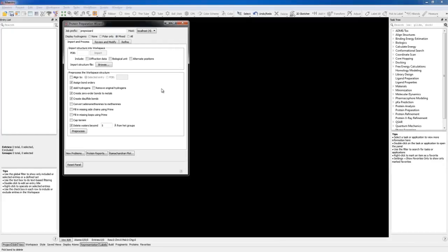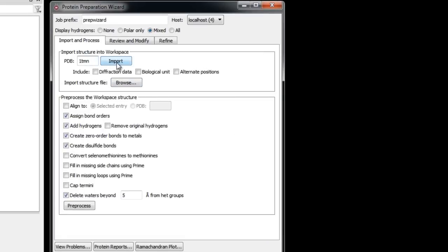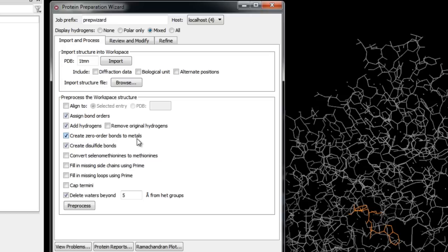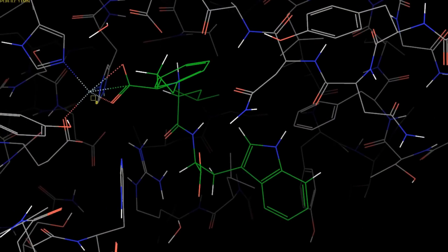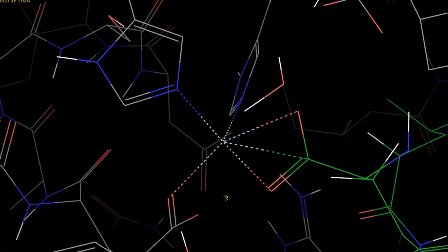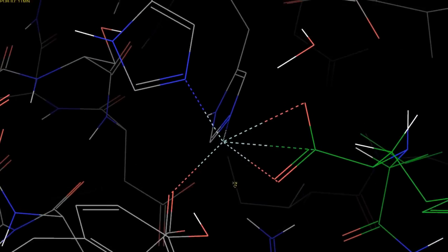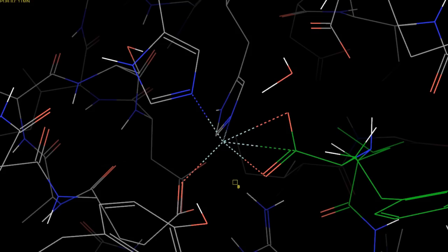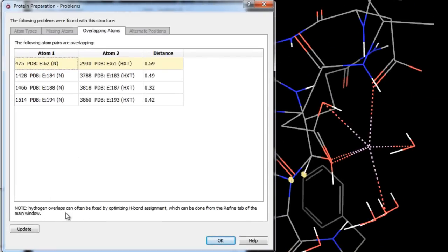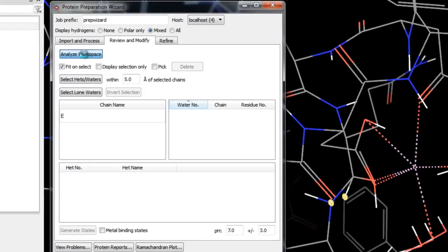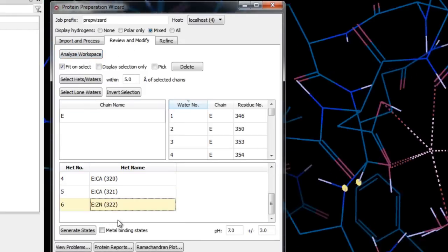Next we prepare a protein with a metal binding site: 1TMN. We ensure Zero Order Bonds to Metals is checked and click Pre-process. Zooming in on the ligand shows zero-order bonds to the metal represented by dashed lines. These define connectivity between the metal and ligating atoms while allowing the metal to be treated as an ion for force field calculations — the zero-order bonds maintain input coordination geometry via bond stretch and angle constraints and allow charge distribution through the entire coordination group. We clean up the representation by deleting the bond between the ion and a carbon on the ligand. In Review and Modify we click Analyze Workspace, noting calcium ions, the zinc ion, and the co-crystallized ligand.